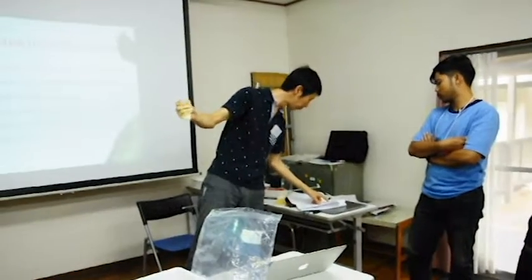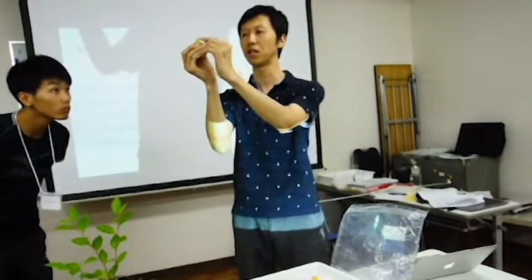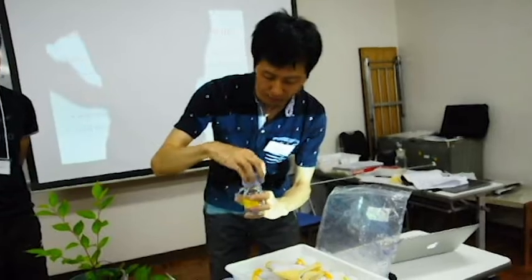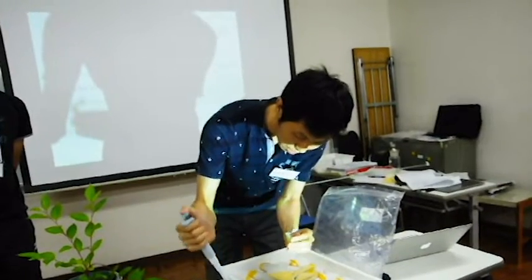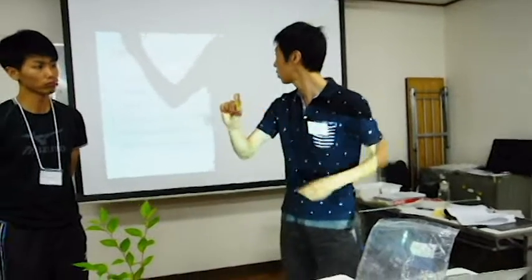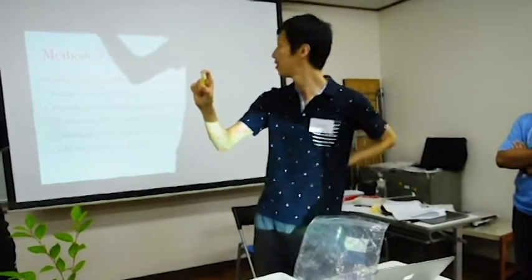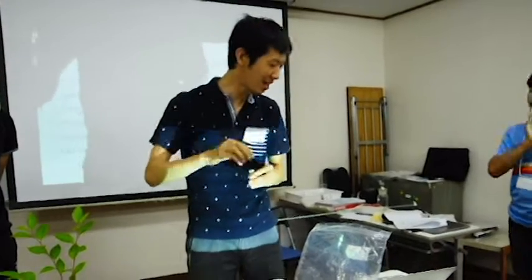If the solvent is volatilized, please add 2 milliliters here, up to 2 milliliters. Okay. This is the method for extraction. Does anyone have questions? Right? Can you do this method? Okay, everyone try it.